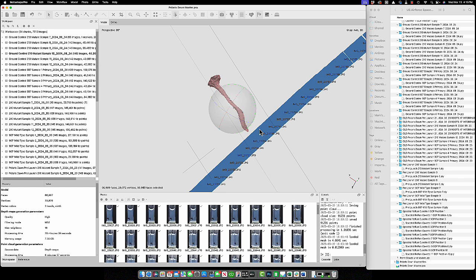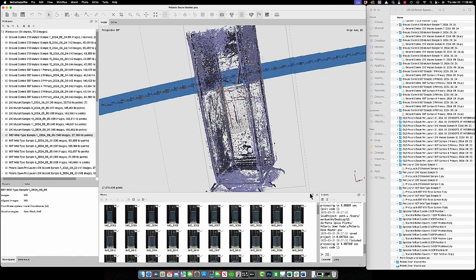This is something that actually Major Travis Tubbs with the United States Air Force had done after my last demo video that I posted online, and it's something that I actually do not know completely well, so we're actually going to sit down together and we're going to try and figure out how he did that on the old model in order to actually show the pathway here. So I just noticed how long this video is getting, so I don't want to make it too long. I kind of want to keep this YouTube video focused on the purpose, which was batch processing.